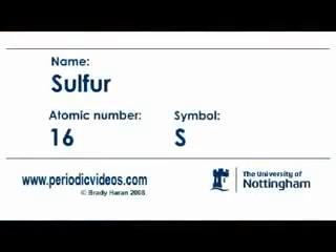We'll take the top off and add a match. The Barking Dog experiment was one of the most famous experiments and a favourite experiment done by my former colleague, Colonel B.D. Shaw.